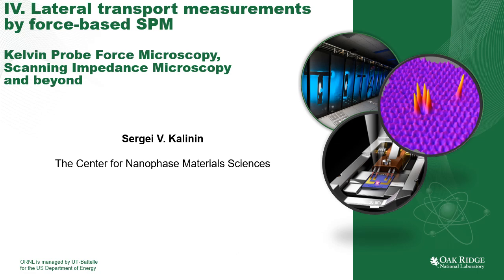Hello, and welcome to the fourth in the series of lectures on the electrical and electrochemical characterization by scanning probe microscopy. In this lecture, we are going to talk about the lateral transport measurements by the force-based SPM.